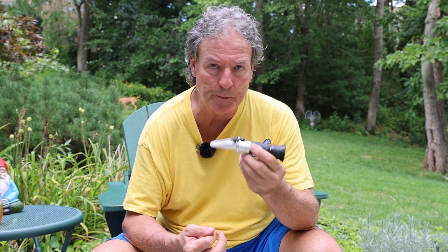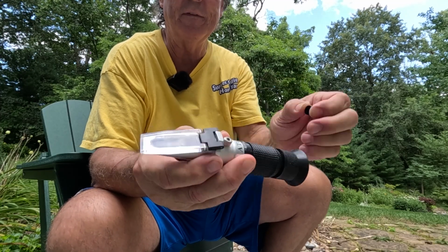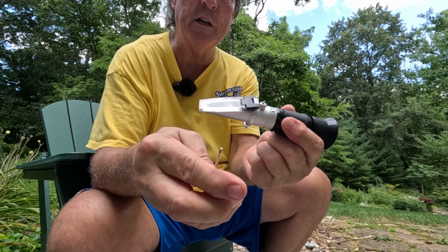And to calibrate it, it's a pretty simple process. The refractometer has a small calibration screw on the top, and it usually comes with a screwdriver. With the refractometer, you're either going to get a liquid that the instructions will tell you, and always follow the instructions that come with it, but it will tell you what to calibrate that particular liquid to, or if it doesn't, or you run out of it, I always use extra virgin olive oil. And get a good extra virgin olive oil, because you're going to have a lot left over and you want to enjoy that in your food.